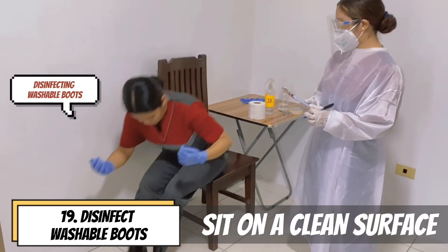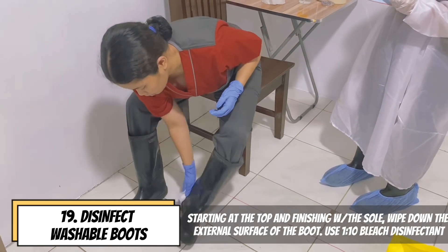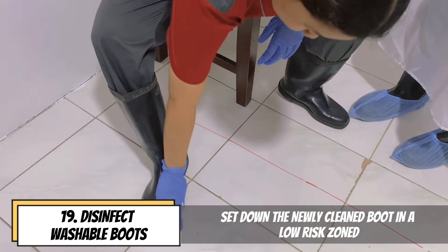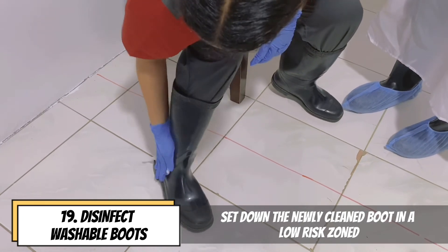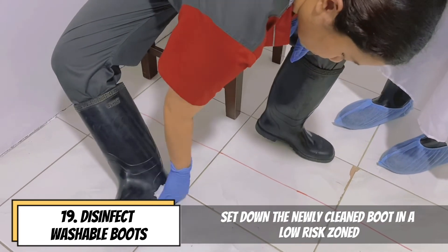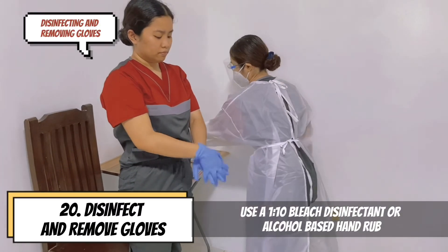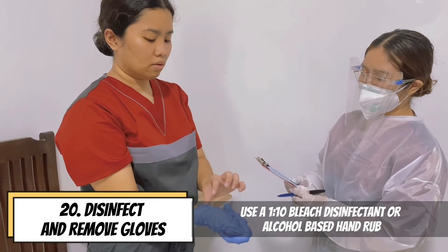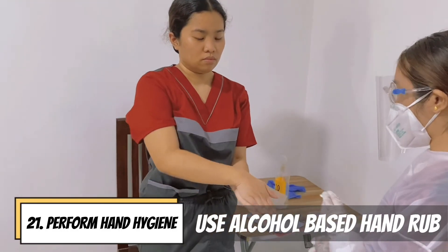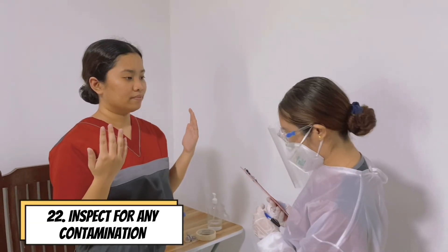Disinfect washable boots and sit on a clean surface. Starting at the top and finishing with the sole, wipe down the external surface of the boot using a 1-to-10 bleach disinfectant. Set down the clean boot in a low-risk zone. Disinfect and remove the gloves using a 1-to-10 bleach disinfectant or alcohol-based hand rub. Perform hand hygiene using alcohol-based hand rub. Inspect for any contamination.